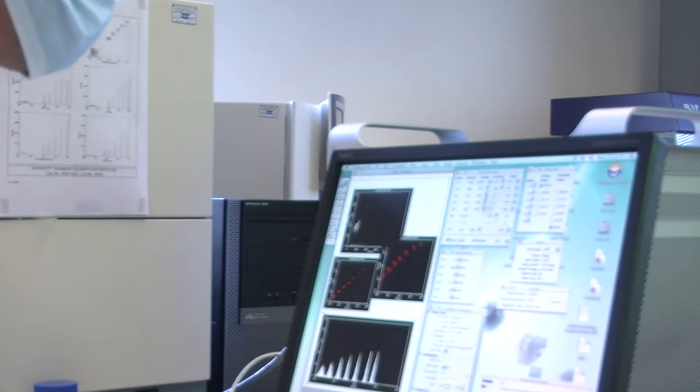So you split it into four, right? Well, you see, what we can actually do is, let's put that to 0.75, and then pause, restart. Okay. All the peaks have now moved up. They're all brighter. Well, they're not brighter per se. I've just turned up the sensitivity of the detector.